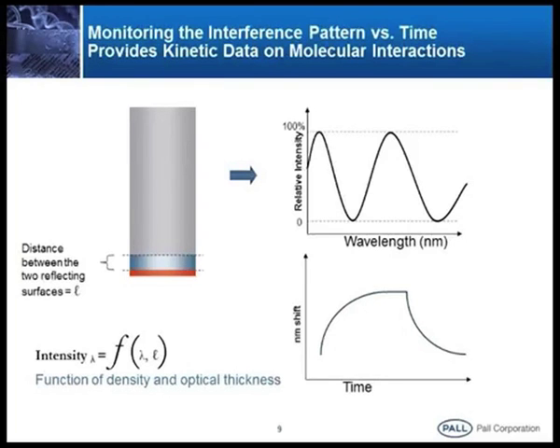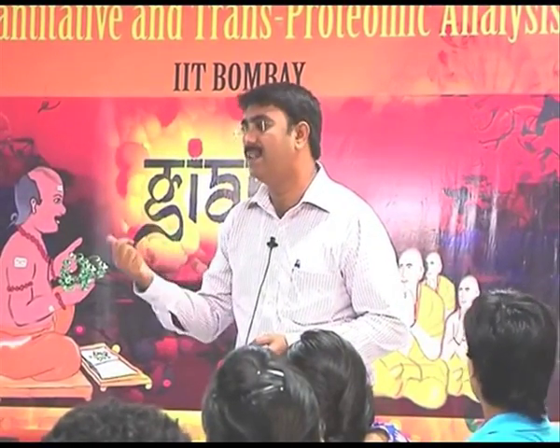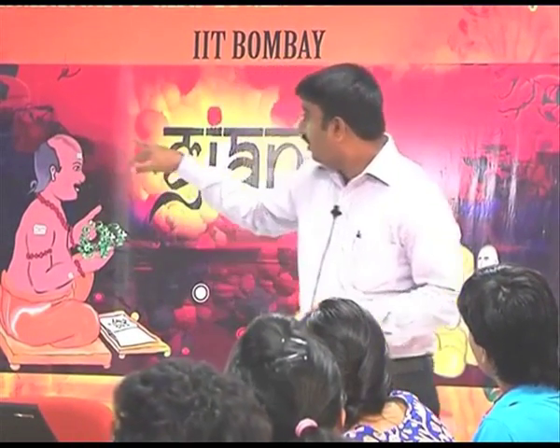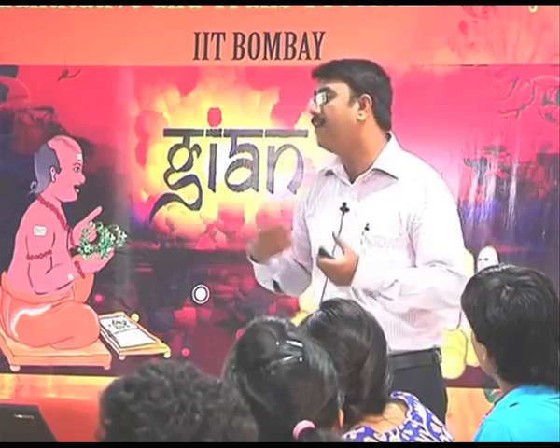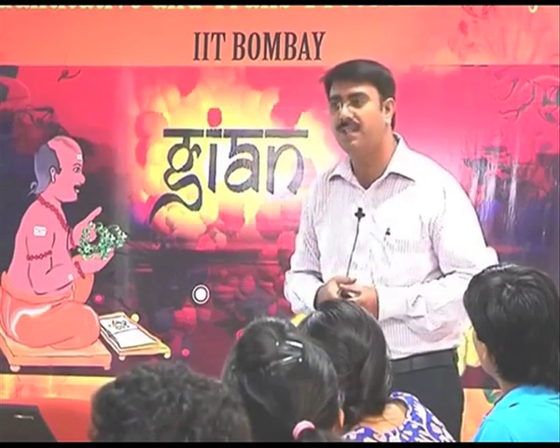Say, in the case of drug discovery, you require a small amount of a drug to elicit a response. Just a picogram or nanogram level of concentration is required to elicit a response, or even the efficacy of the drug, I mean to say. So such things come into the picture here. Less concentration, more response, longer time in the body. That is what we call a strong affinity towards the receptor.